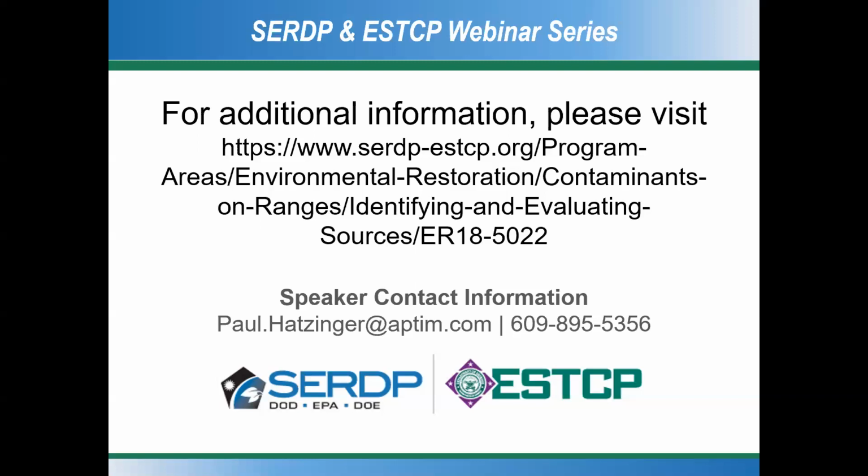There are. So for organic compounds, for CVOCs, Microbial Insights and Pace Analytical both offer commercial analysis of both carbon and chlorine isotopes. Pace also offers analysis of deuterium and carbon in 1,4-dioxane. The University of Delaware, Neil Sturchio's lab, has a small private laboratory that will do isotopic analysis of perchlorate.